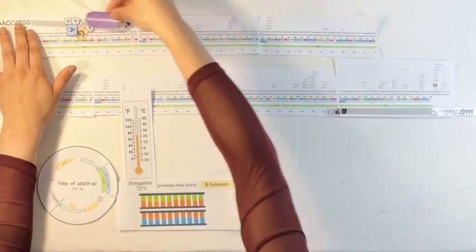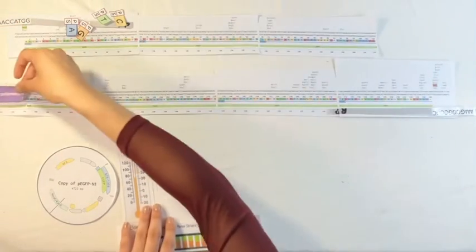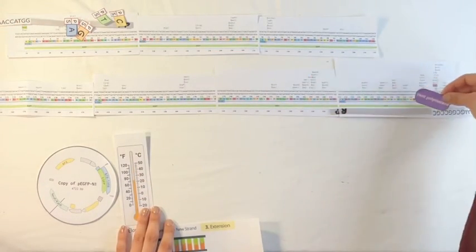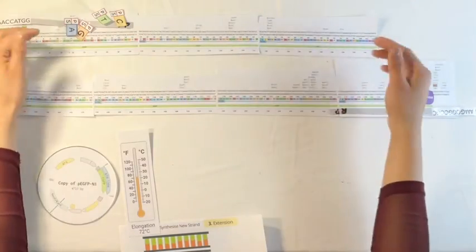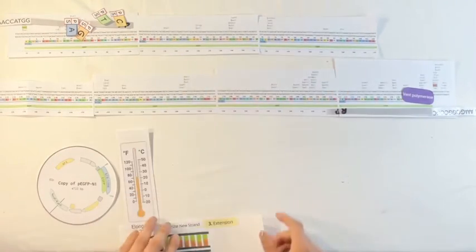Vent polymerase is going to run along this site all the way until it reaches the other primer. Through that, we're going to get clones and many amplified EGFP gene products.